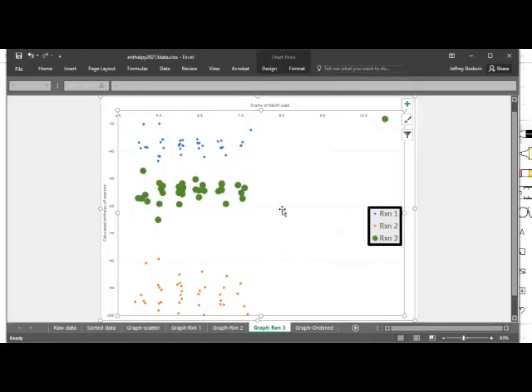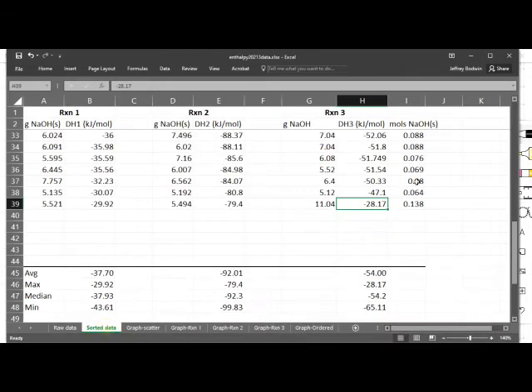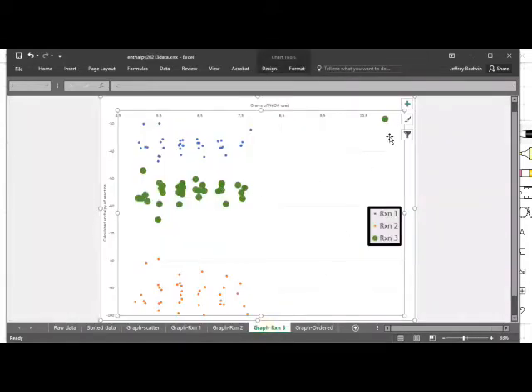This one, it's really something that we want to look at as just a way to visualize, because looking at the data, you might not really notice that that one seems way out of bounds and way off base. Looking at the graph, it's pretty obvious that this data point is just so out there and something's really wrong with it. So when we calculate an average, we should be able to statistically eliminate this as a data point. But again, because I know that it was done incorrectly, we can legitimately just not consider that in our average.